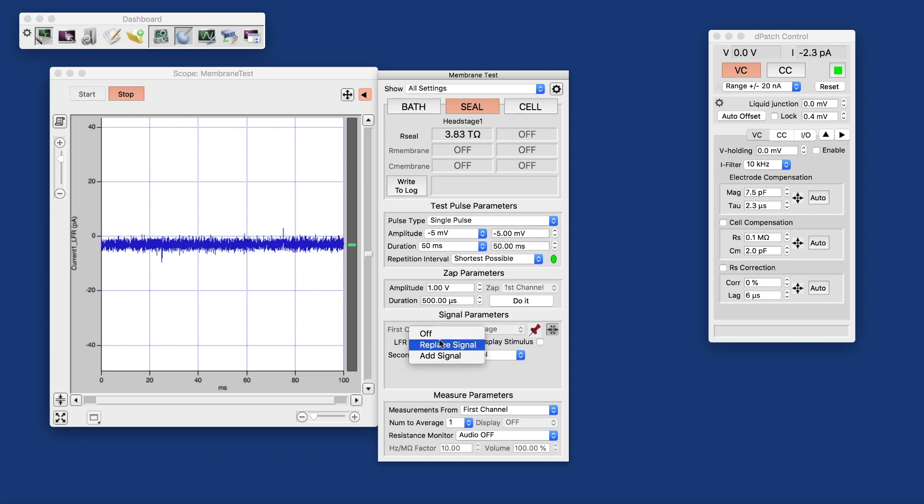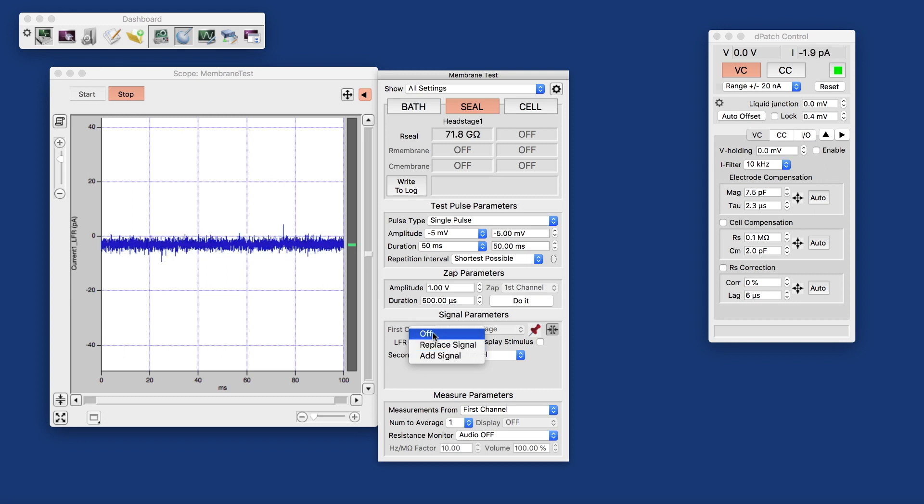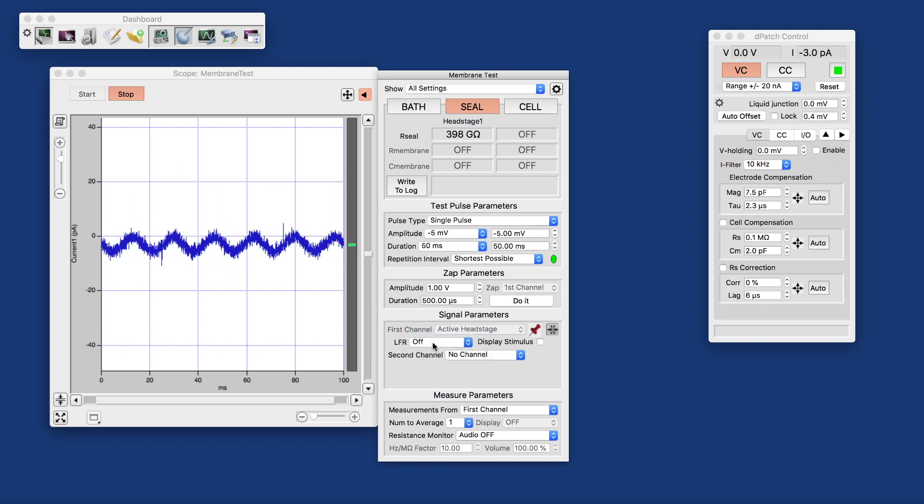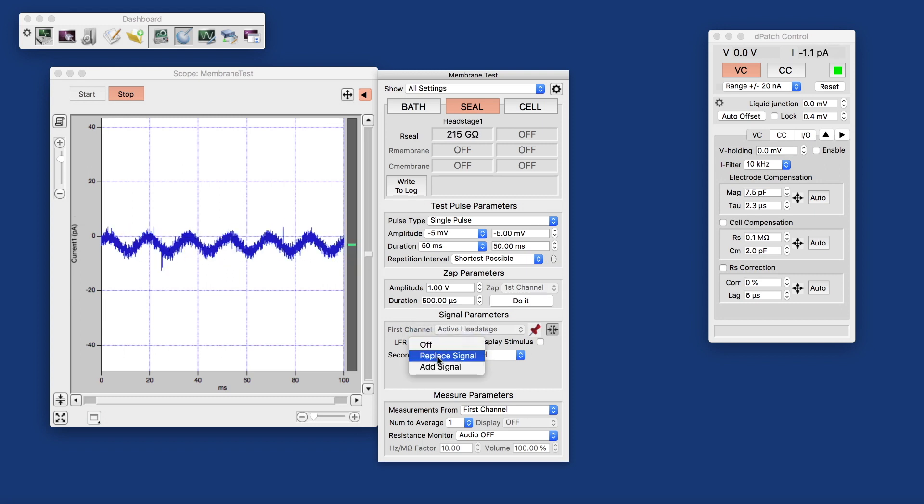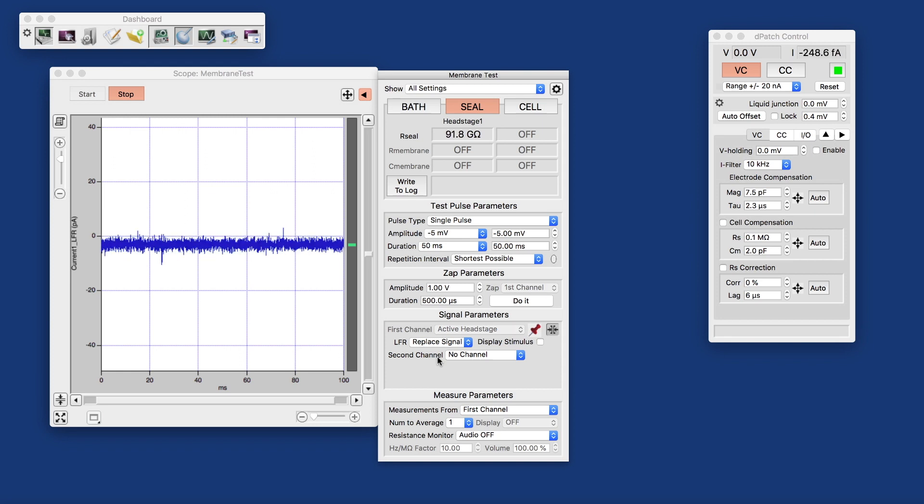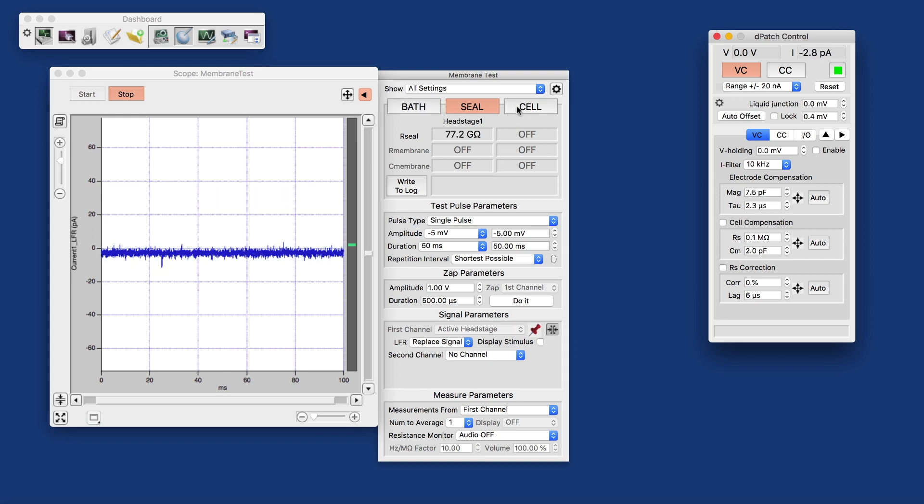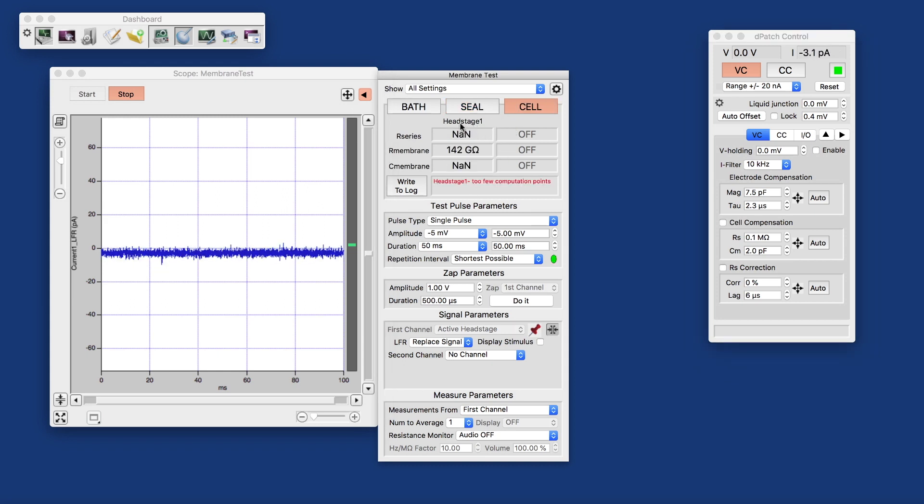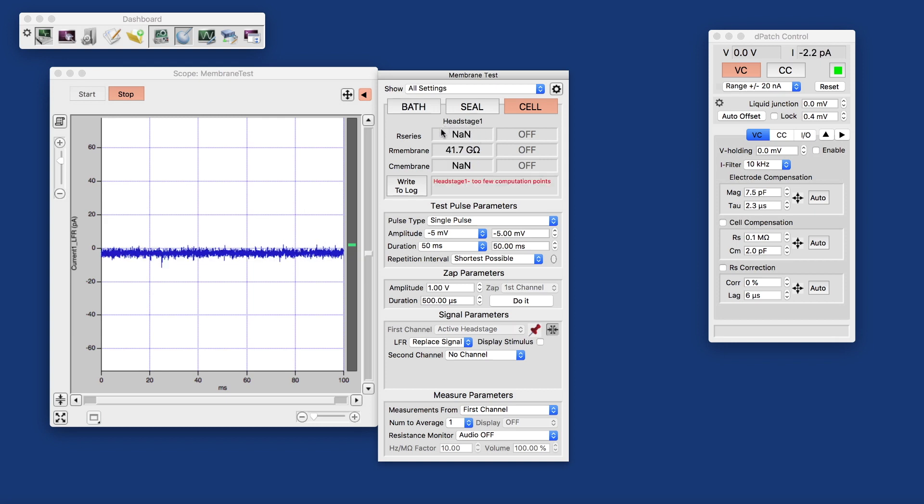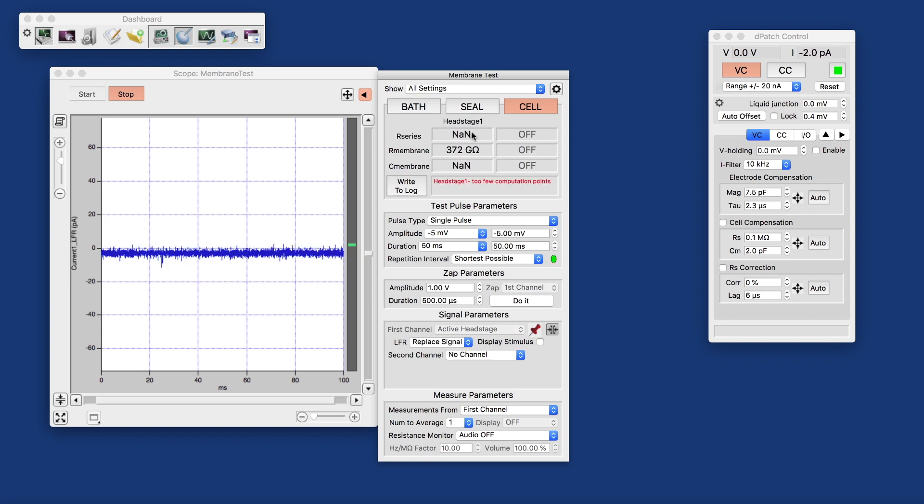So let's compare that again. Let's switch that off. And replacing the signal pretty much eliminates the line frequency. The next thing we will do is switch to cell because then the membrane resistance is written to the log here and then also used for the metadata.